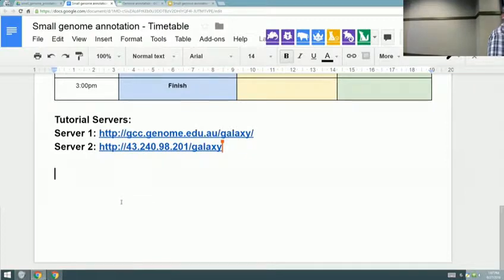Just tell them what each of those subprograms actually do, maybe after the shoot. I don't think it's useful, to be honest. I don't know. How are you going to do it? I think protocol's important. And Aragorn.